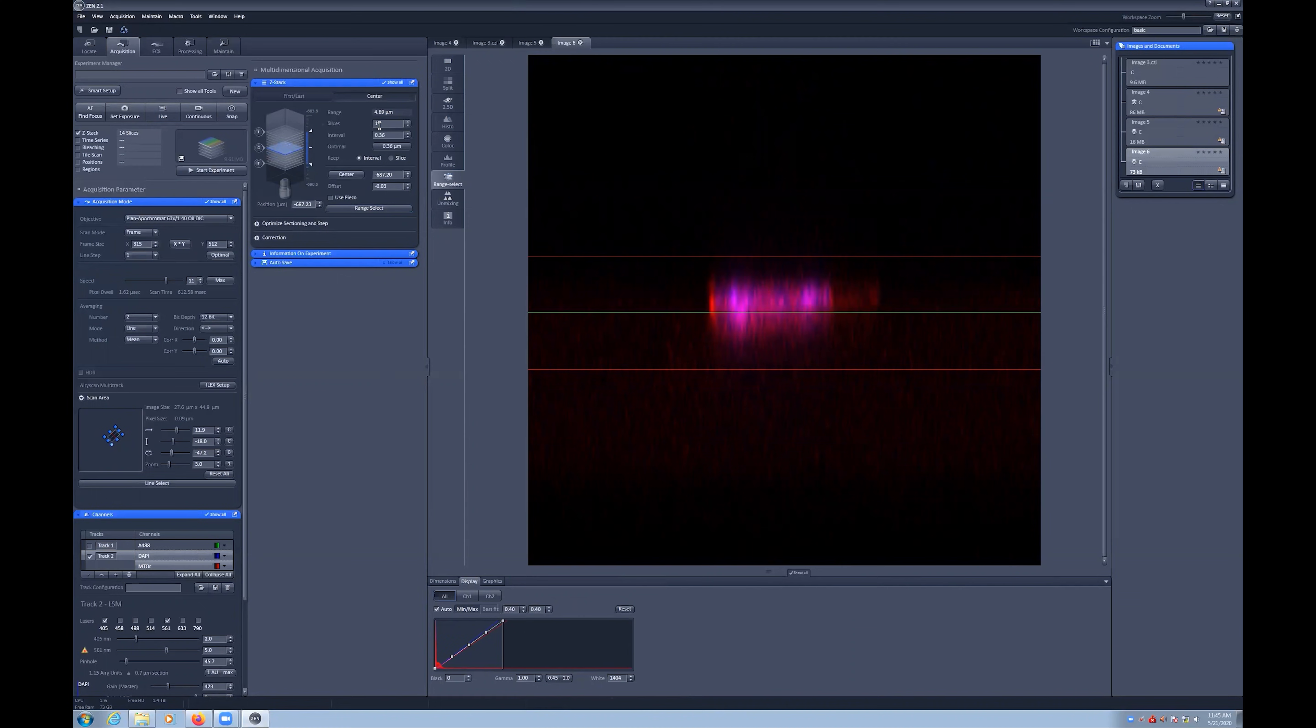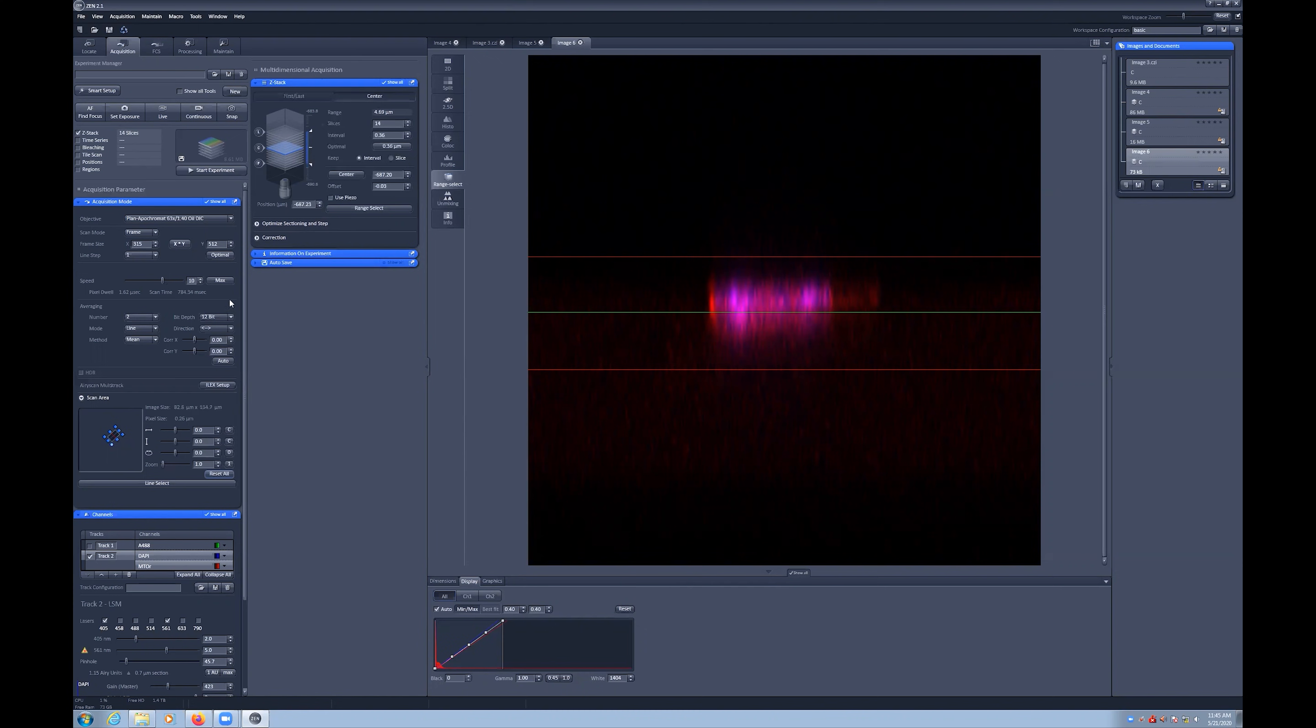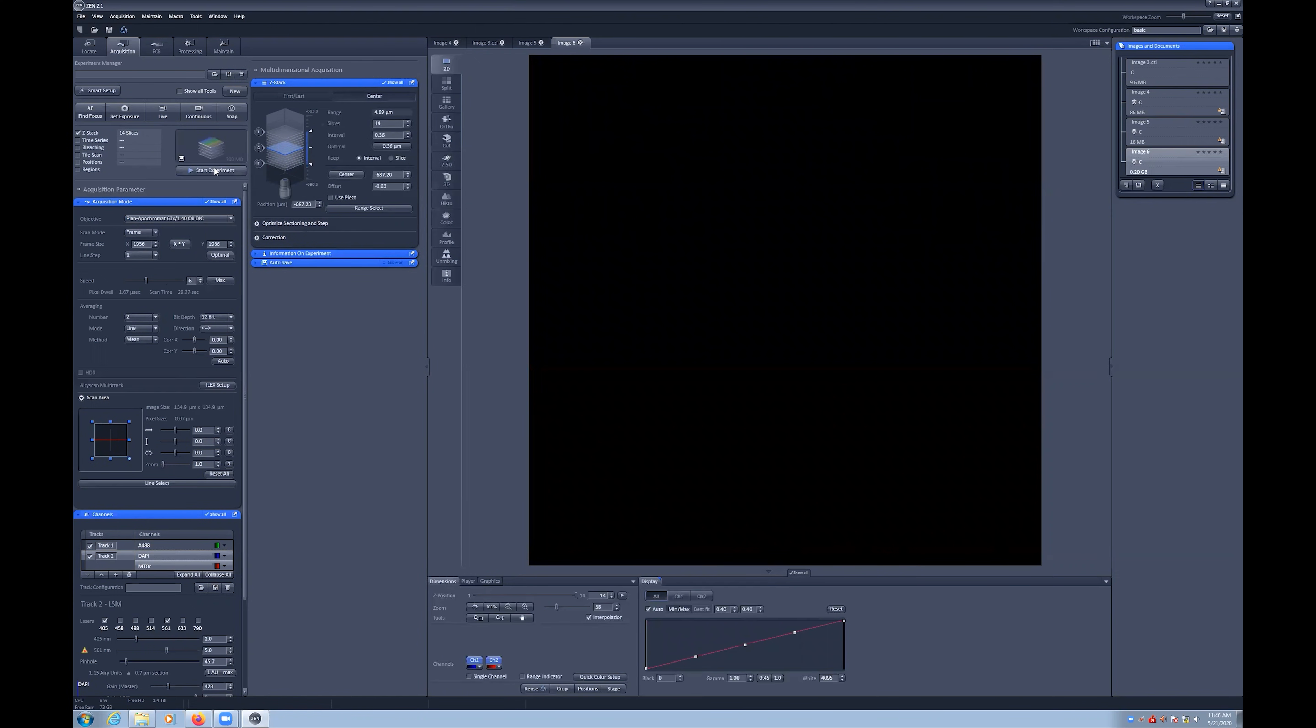You can also reset the crop area in the adjustment menu, but be sure to also recheck the scan area settings as well.